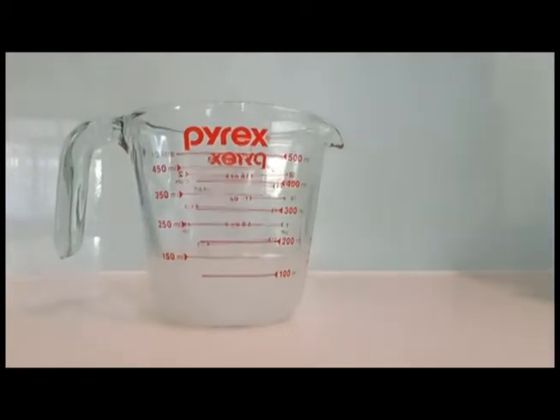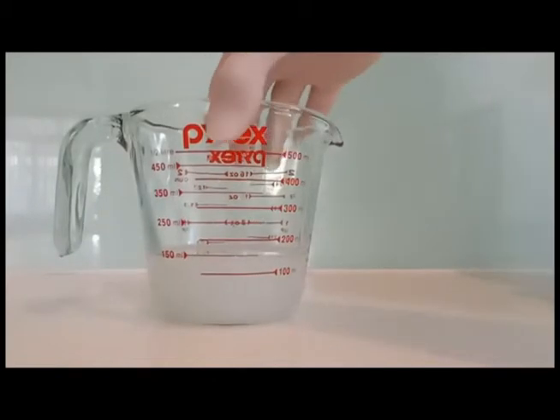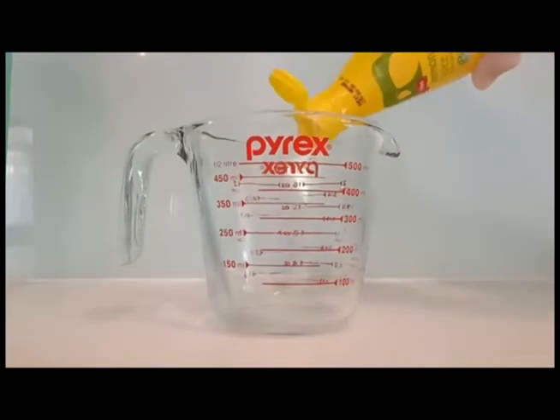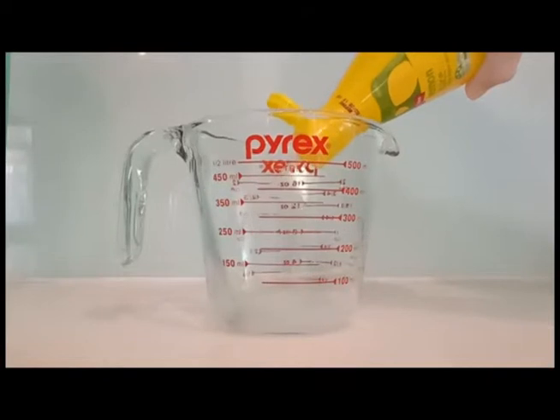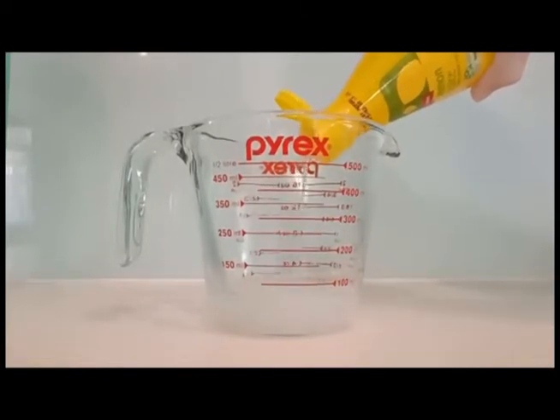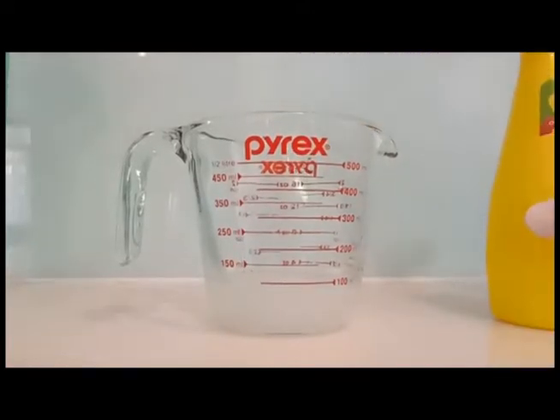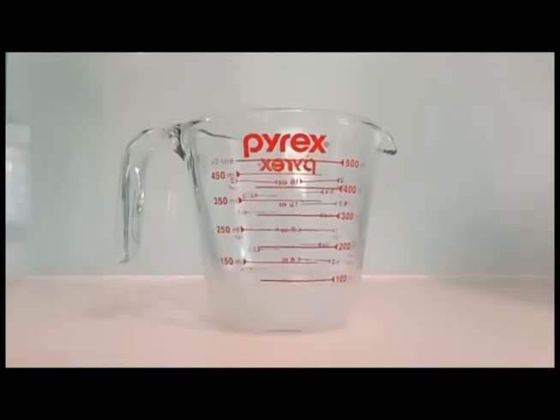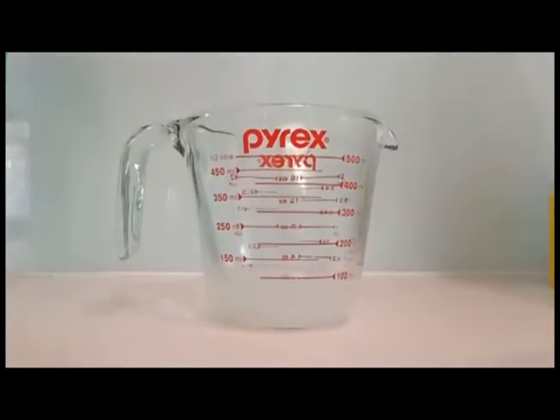The equipment is 150 ml of methylated spirits, 90% ethanol, 150 ml of vodka, 40% ethanol, 250 ml of lemon juice, citric acid, 200 ml of water, 6 raw eggs, 6 small plastic containers, and a kettle. The considerations are that the experiment should be conducted in a well-ventilated area due to the use of methylated spirits.